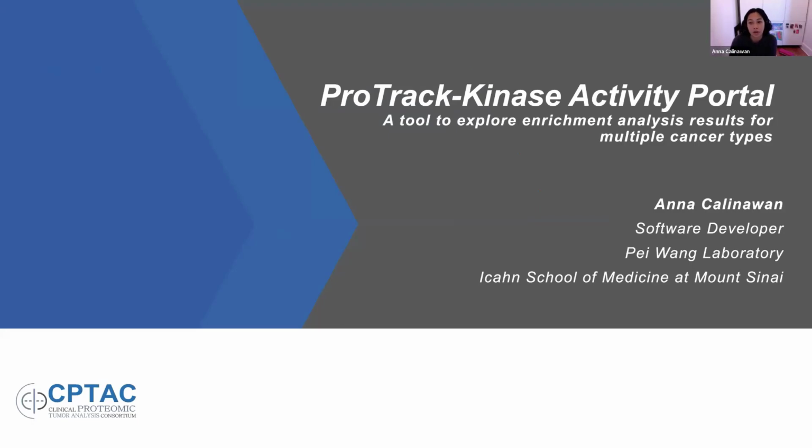I'm a software developer at the Pei Wang Lab at Mount Sinai, and I'm here to talk today about the ProTrack Kinase Activity Portal. It's a tool that we developed to help people explore the results from kinase enrichment analysis that we performed on the CPTAC data, which stands for Clinical Proteomic Tumor Analysis Consortium. And let's just jump right in.